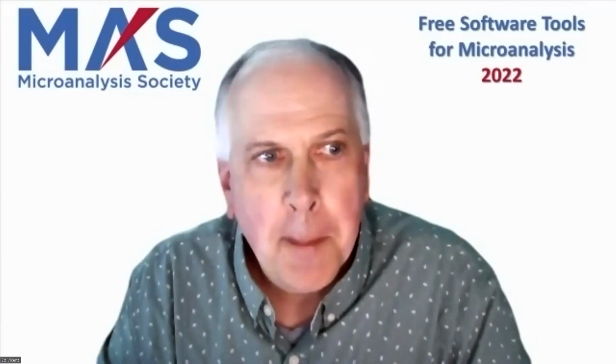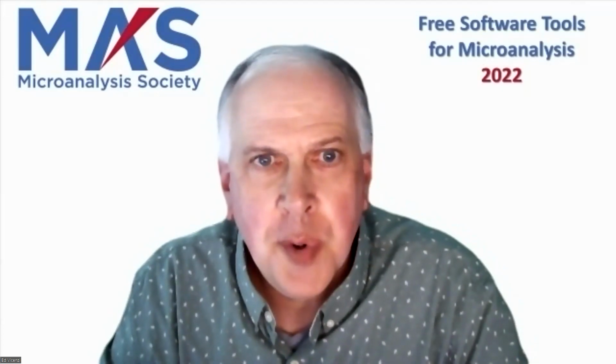Okay. Thank you. One final question regarding Casino: as far as I know, it is the only Monte Carlo program to simulate cathodoluminescence. Is there anything you want to say about that before we finish up? I think if you want to do CL, you should use Casino-III. We have developed a lot of the energy deposition that we use for CL, and it is really well developed. You can have a 3D matrix, have a diffusion matrix, and I have a paper that I wrote with Casino that uses these for CL simulation.